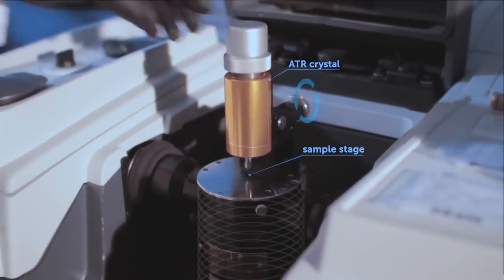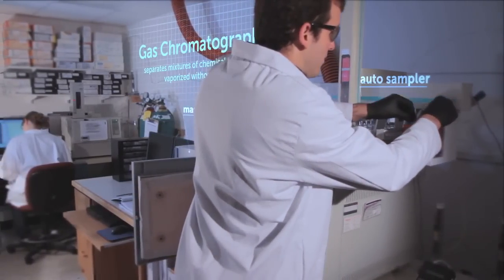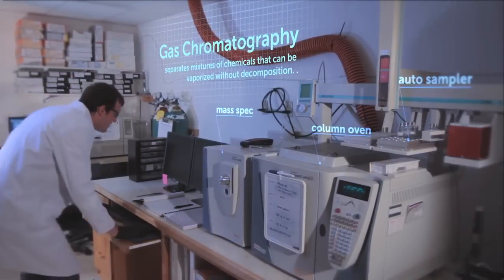The second method of analysis, the GC, is powerful because it separates the chemicals into individual compounds, identifies each, and provides the exact concentration of each of the chemicals.